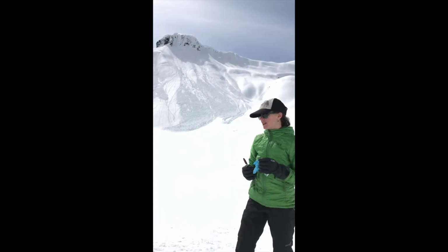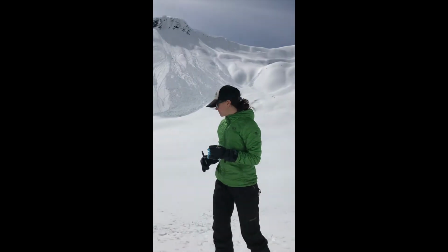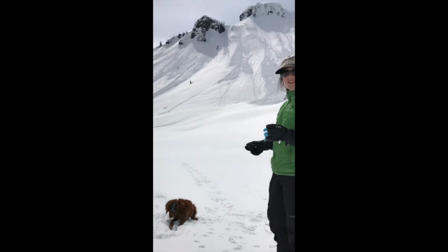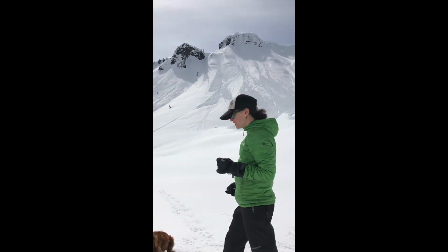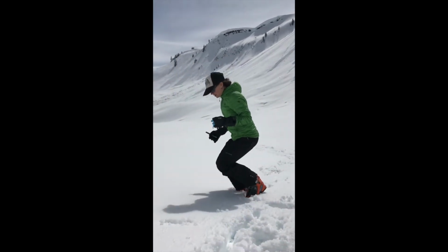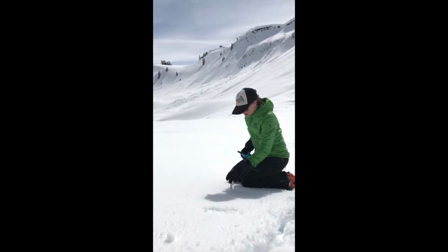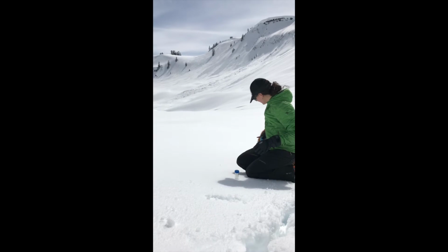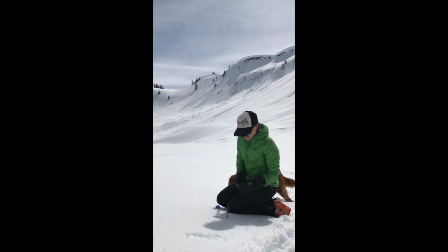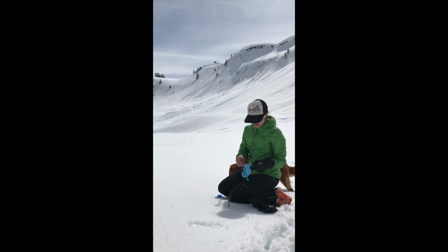So you want to find an area of snow that's undisturbed. I've got my snow sampling helper over here making a mess, and so I want to make sure that I don't sample where he's run. So I'm going to come over here to this patch of snow, find a place where the snow algae are obvious. I'm going to take off my ski glove.